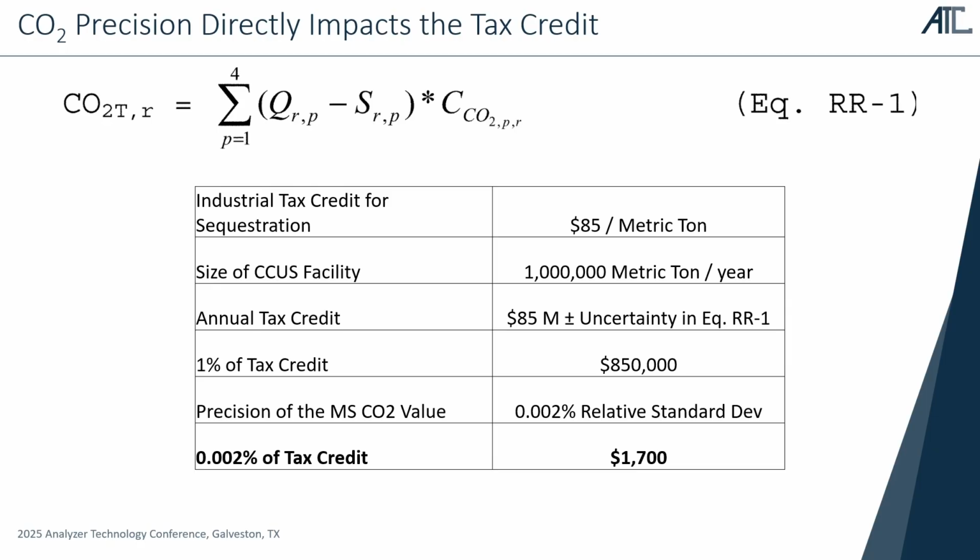In addition to that, if they see benefit in having a faster analysis from the mass spectrometer, so they're getting updates in seconds as opposed to minutes, that can allow them to do a couple of things. Some people will use additional speed to analyze multiple samples throughout the plant with one system instead of having dedicated analyzers for each sample point. Or they're just using the speed to ensure that they have optimal control, right? Just fresh data that they can respond to very quickly. So typically that's where you see the differentiators between a mass spec and a GC.